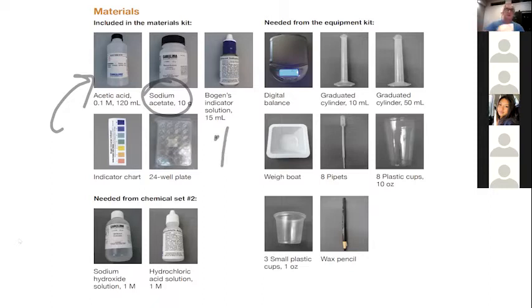This is a different pH indicator than we used last week. Last week's pH indicator really only showed you the difference between lower than pH 8.5 and above pH 8.5. That was the phenolphthalein, which changed color above pH 8.5.